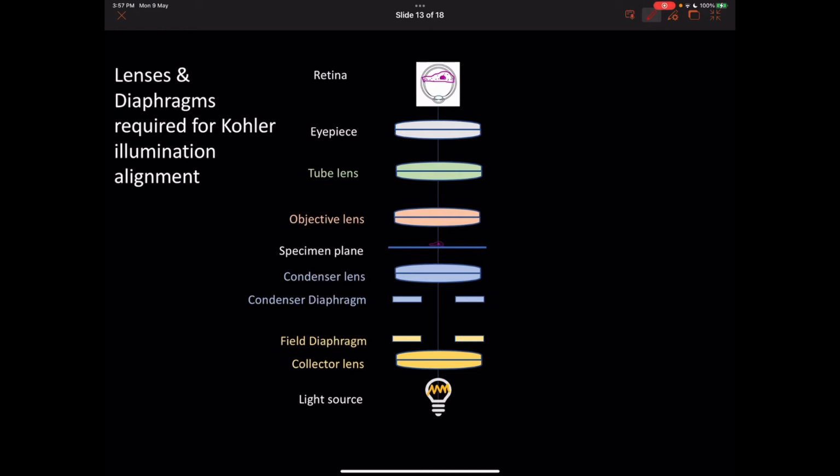That is going to take you a lot of your time, right? Think about it. This makes sense: keep some parts of the microscope optics fixed in their alignment in x, y or z, in all the possible directions, and only keep some of the parts available for you to align in the x, y and z direction. It will take only a small time for you to align those limited number of optics and get your illumination perfect.